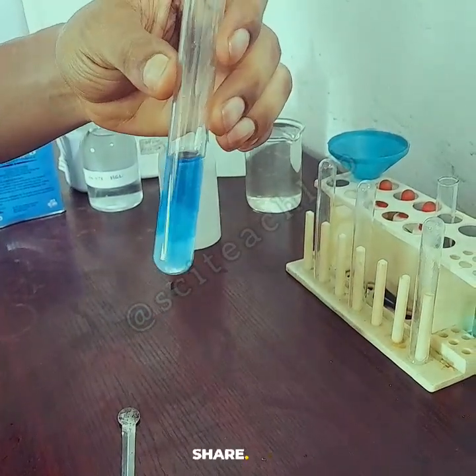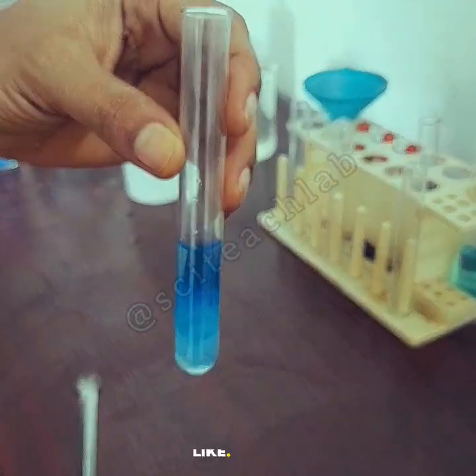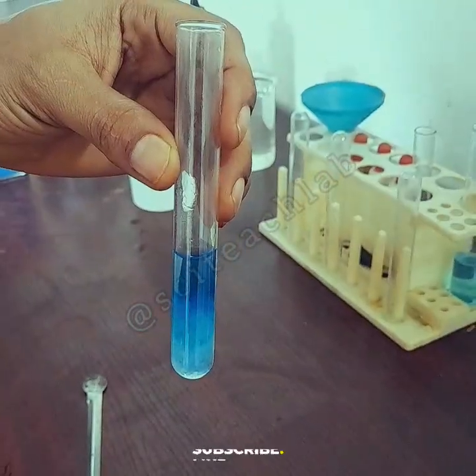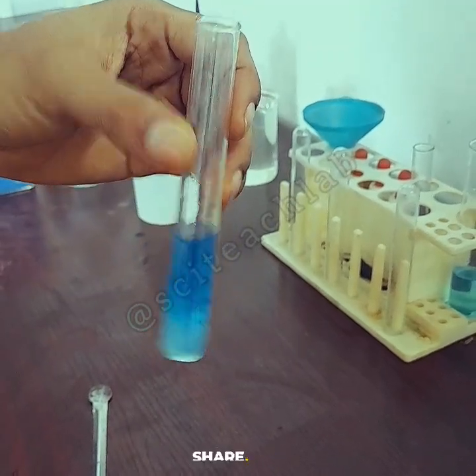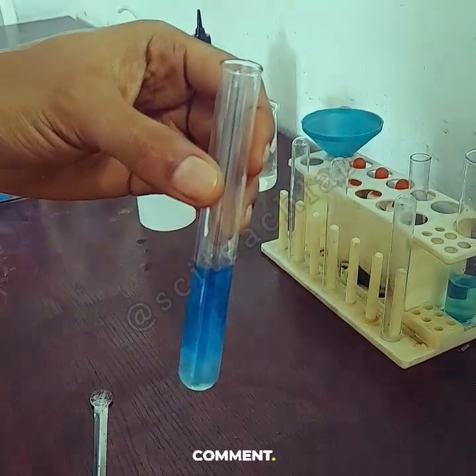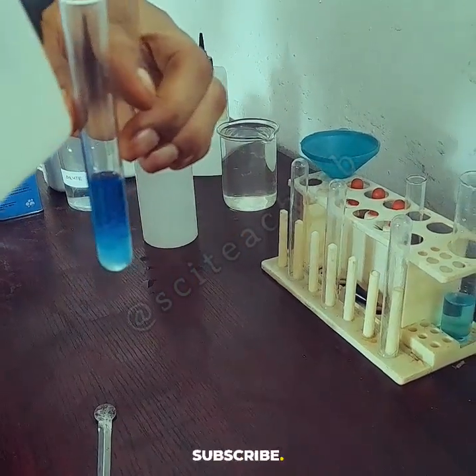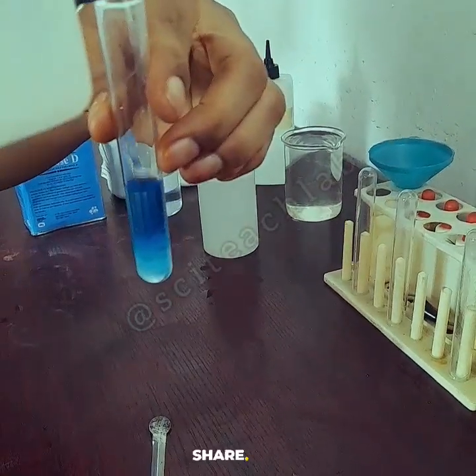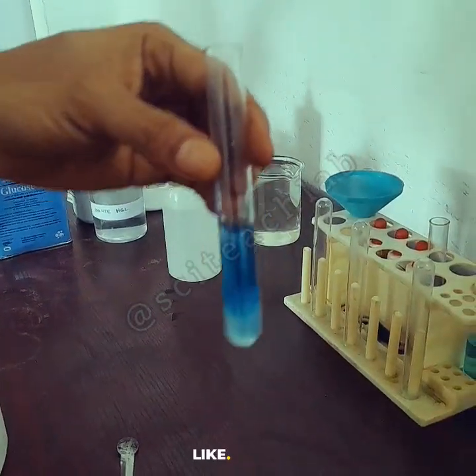Then I add sodium hydroxide in excess. When I add in excess, I see the precipitate does not dissolve. You can still see it inside there. Even when I shake it, the precipitate just goes up and comes back, which means that the ion present in there can't dissolve even in excess sodium hydroxide.